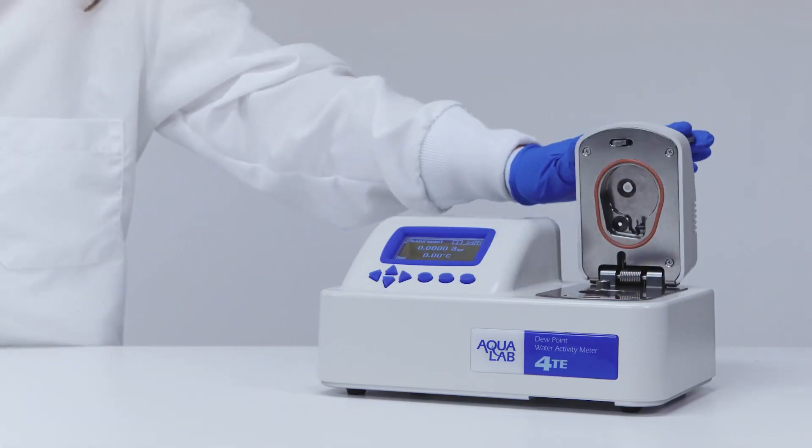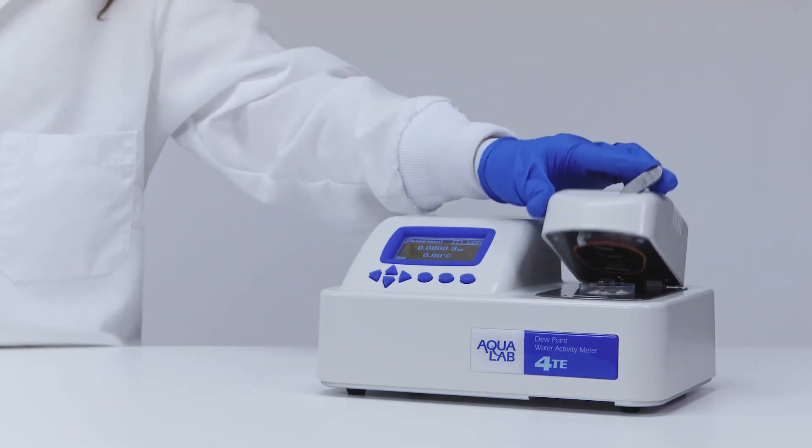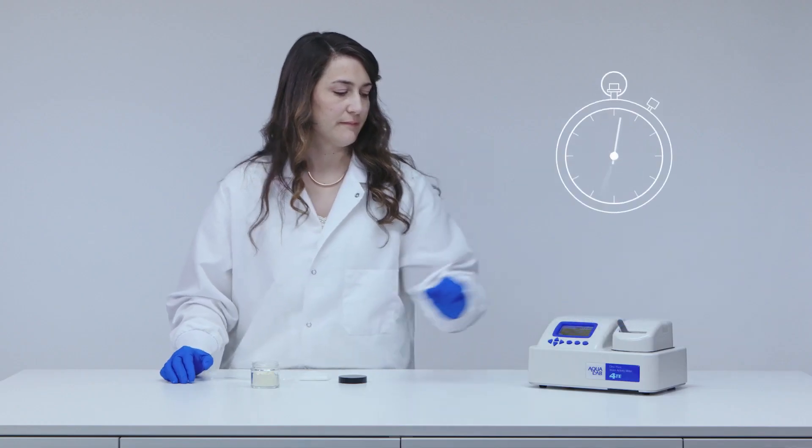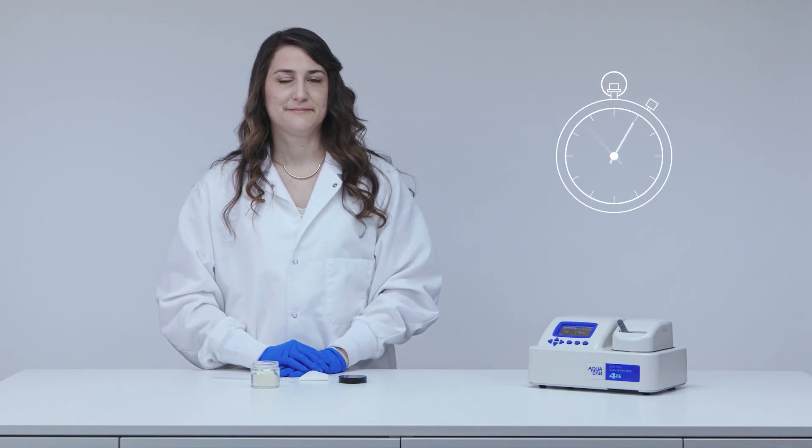Open it, put a sample inside, close it, and in about five minutes you get a water activity reading.